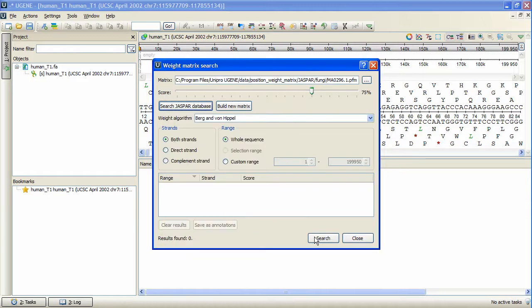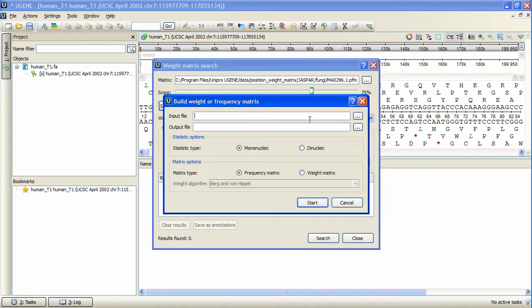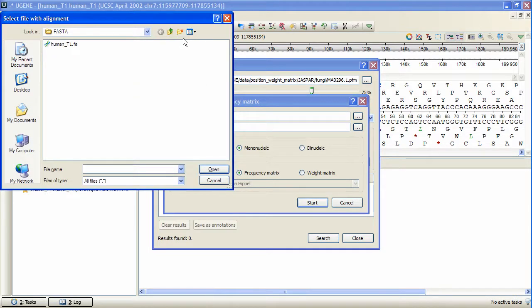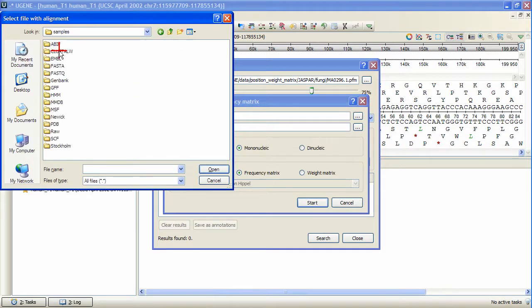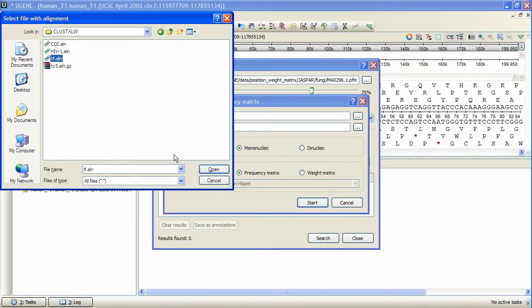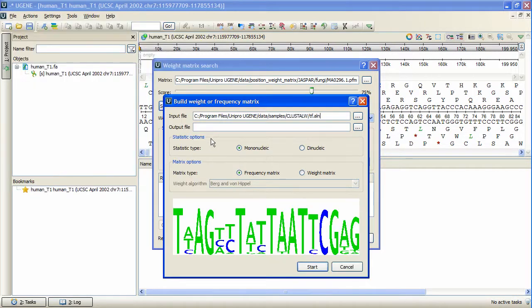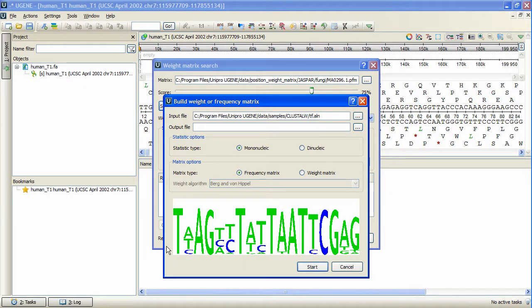The last way to choose a weight matrix is to create a specific one from an existing alignment. We press Build New Matrix and select certain alignment as the input. The alignment must contain no gaps. After the alignment is set, the alignment logo will appear at the bottom part of the dialog box, giving a representation of the selected alignment.